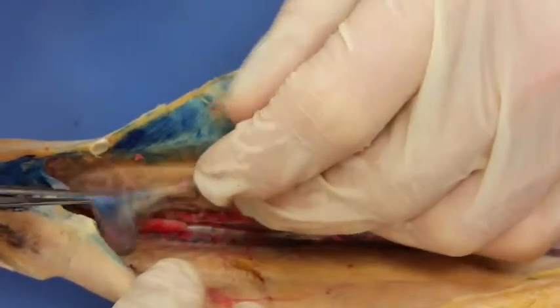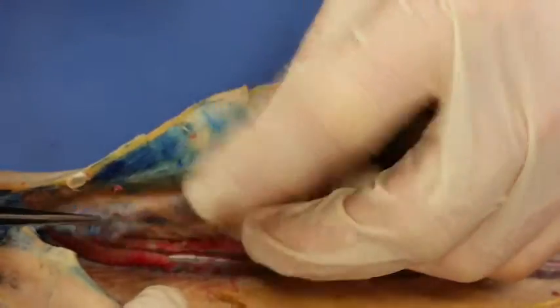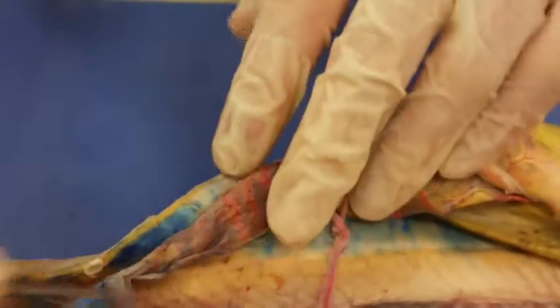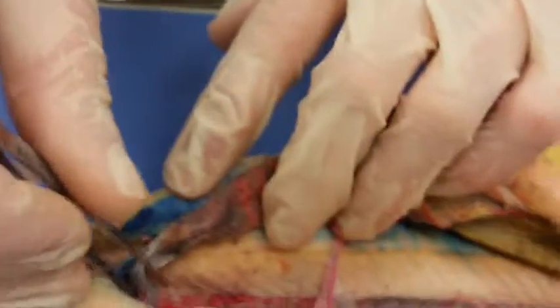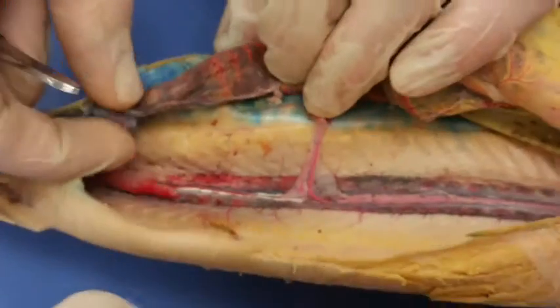To the uterus, which our uterus is near the valvular intestine. They should be connected way up here, but again, like I said, we cut the greater omentum ligament, and therefore things are not hanging quite like they should be right now. But that's our uterus.